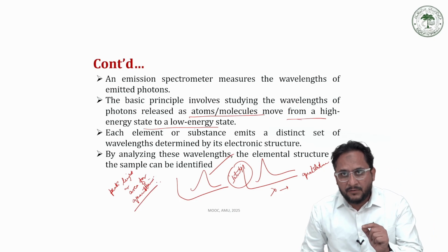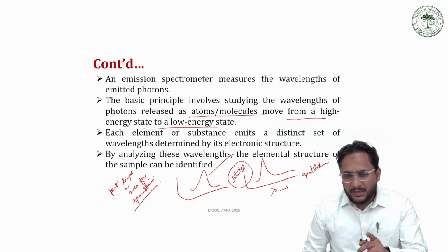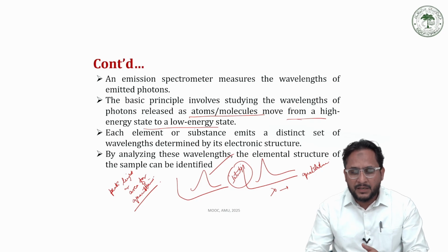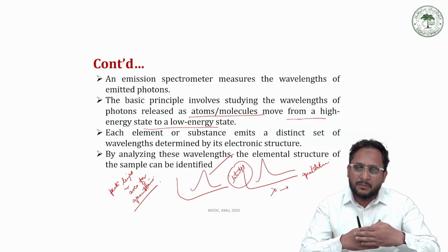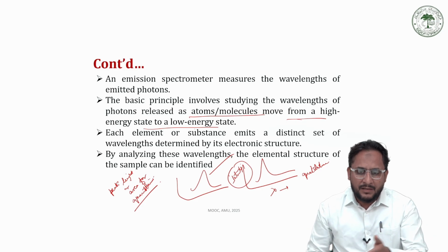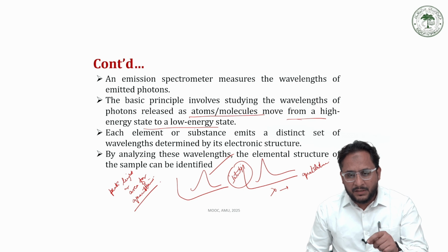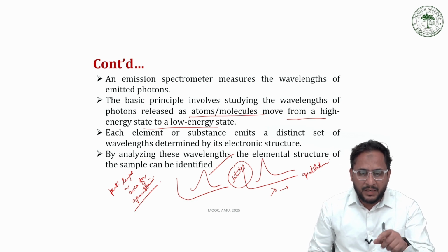For quantitative analysis, we need a calibration curve, while for qualitative analysis, we only need a standard through which we can compare the sample data as well as the standard data, and if the peaks are matching, we can easily identify that this peak belongs to that particular compound. But for quantification, we need to prepare a calibration curve.